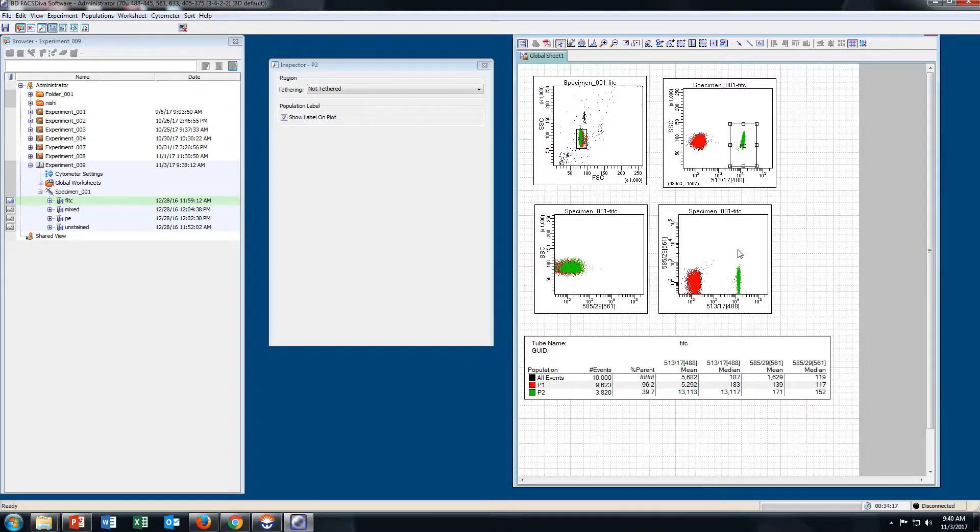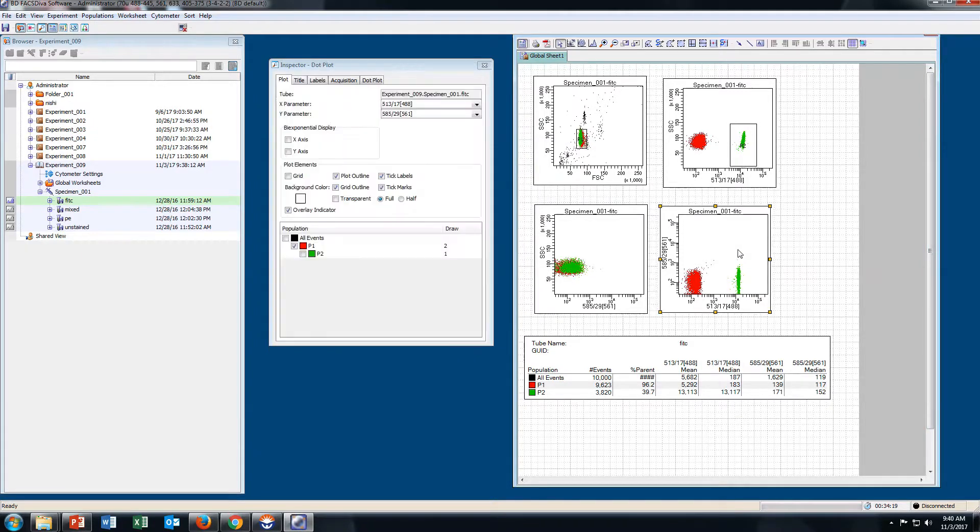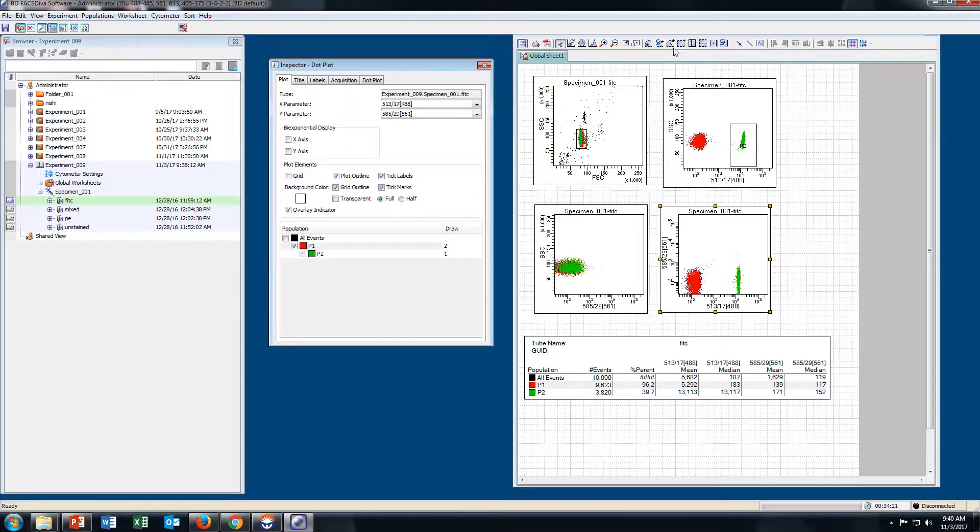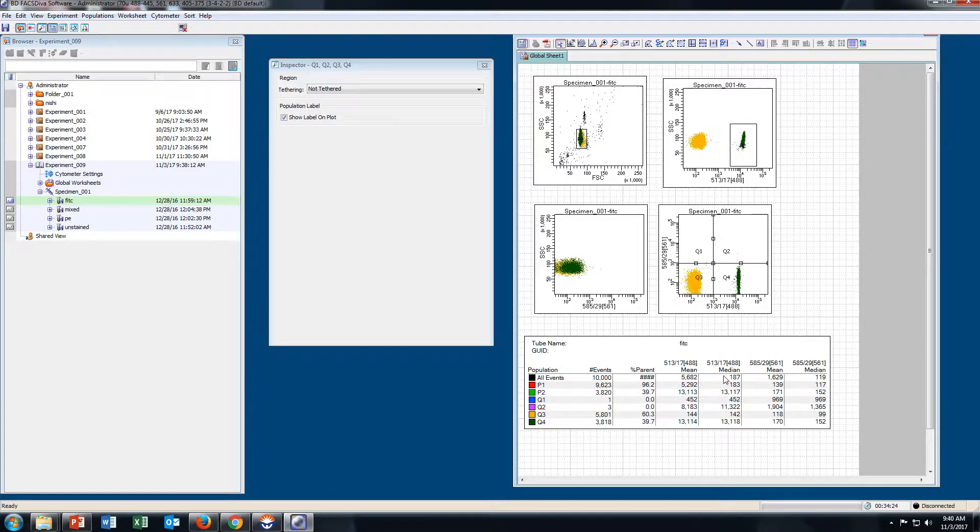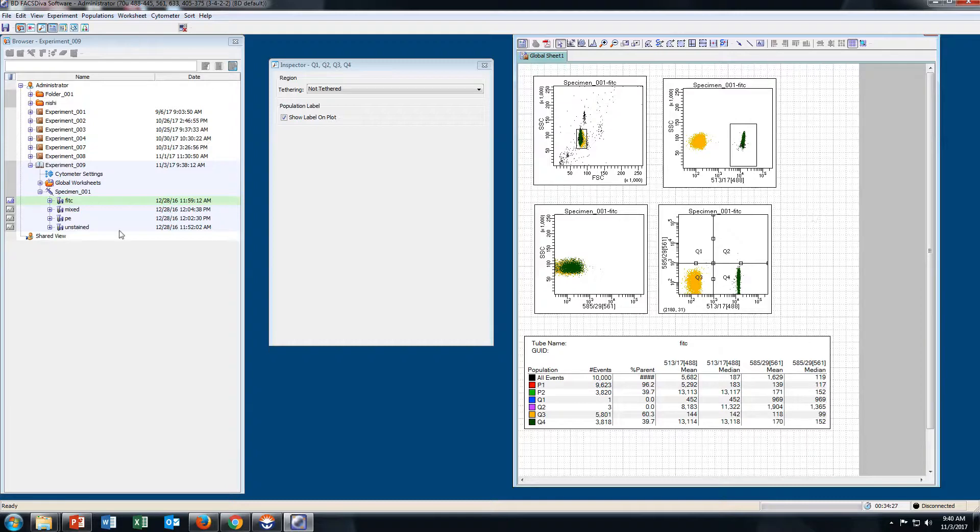To create a gate in dual parameter, click on P1 and take a Quadrant Plot. You can see the plot here.